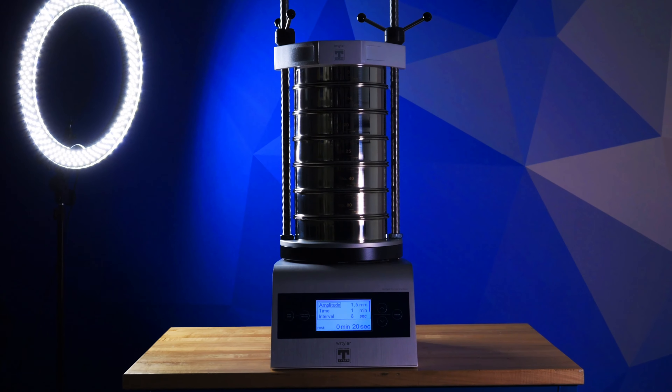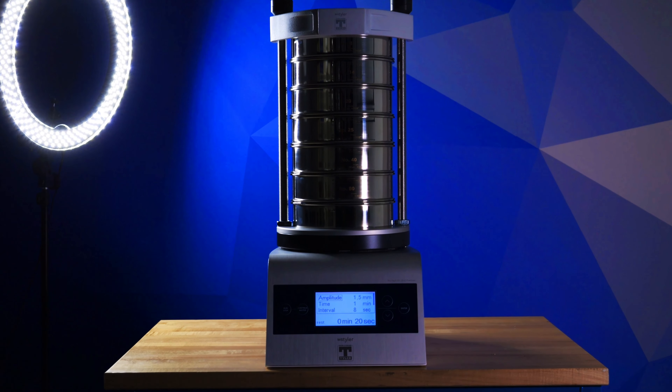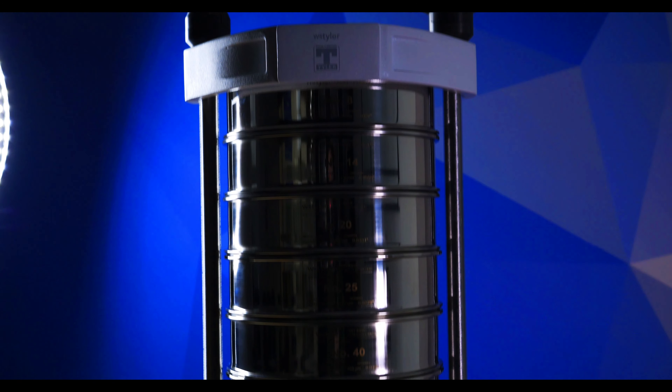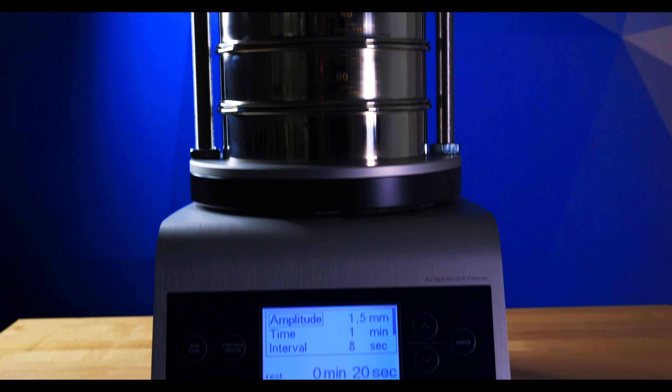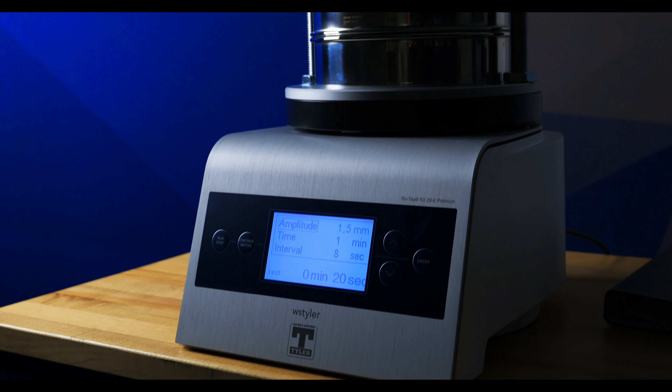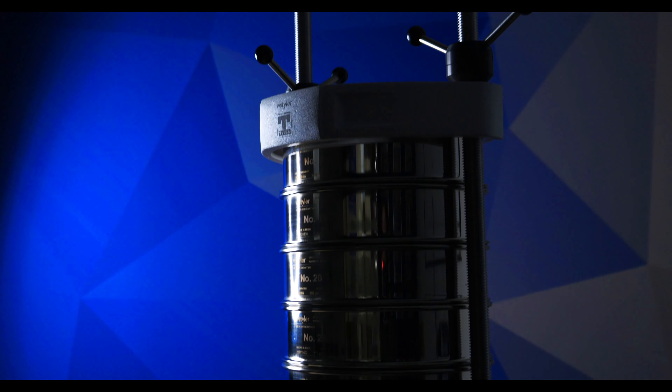The Rotap RX29 ePremium is an electromagnetic sieve shaker designed to give lab technicians complete control of how material is tested. This level of control is granted through the device's control panel, which allows users to operate within an amplitude range of 0.1 and 3 millimeters. The ePremium is designed for sieve analysis labs that rely on particle analysis results that are accurate and repeatable. The device's customizable amplitude allows particles ranging from 20 micron to 125 millimeters to be tested with ease.